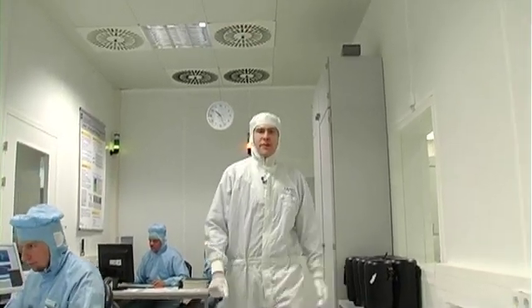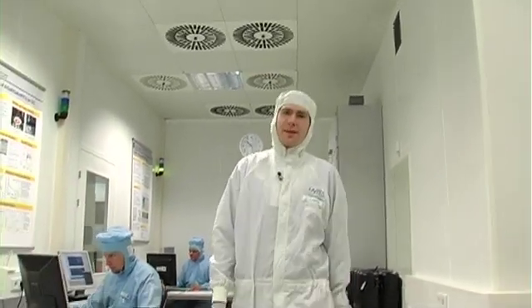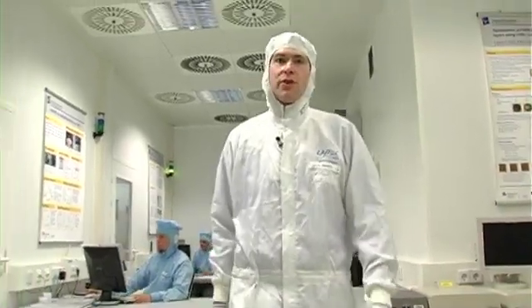One area of specialty here at Ferdinand-Braun is development and small-scale production of semiconductor structures containing ultra-thin layers. Let's take a look now on how that works on some of their setups.